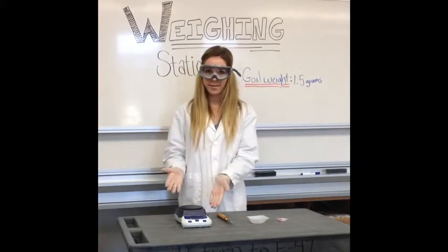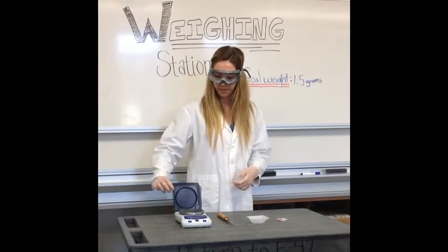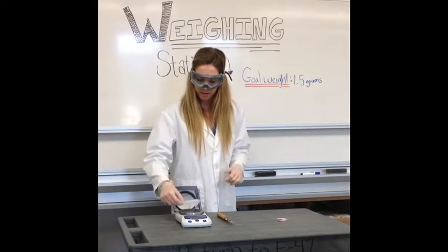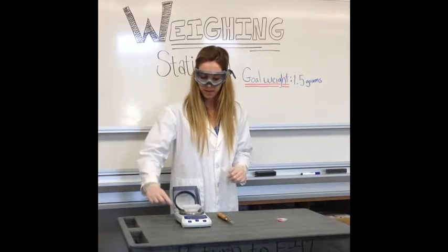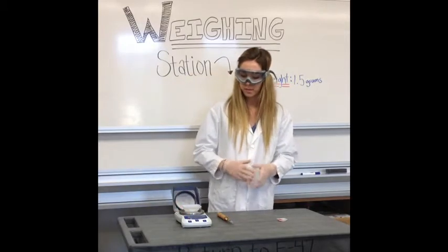First off, this is a weigh balance, and this here is the lid. So we need to open up the lid, and we're going to take our weighing boat and set it on the weigh balance. The first thing we need to do here is click the zero button, so we can properly weigh out the amount of grams that we want to put there.